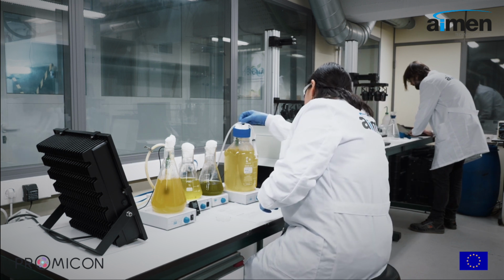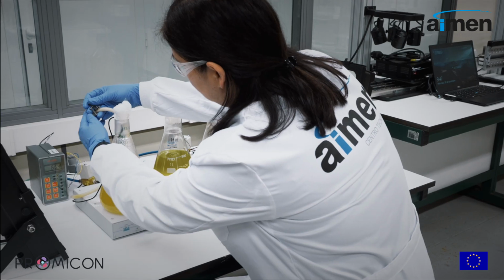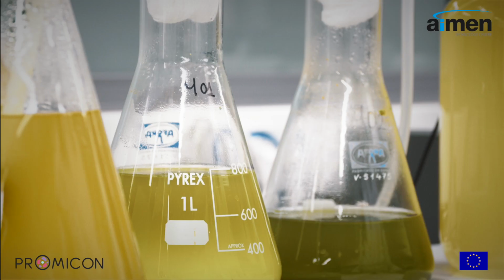The first step consists of measuring the total amount of biomass by volatile suspended solids analysis during the growth phase of the microbiome in a photobioreactor. These photosynthetic microbiomes were selected in advance by the UPC.